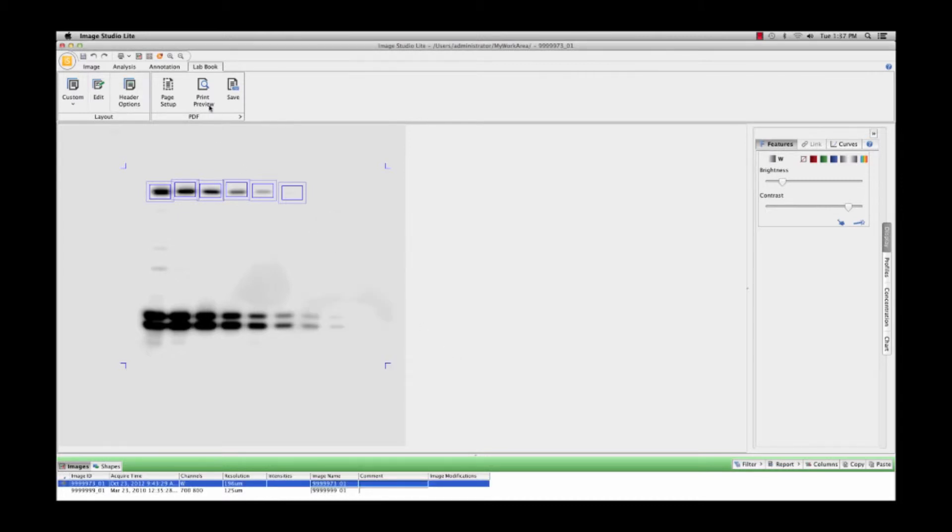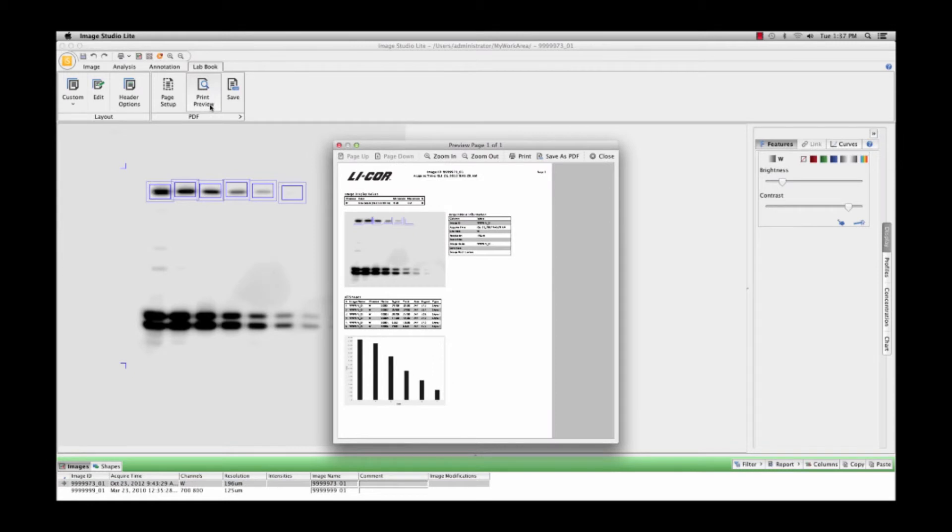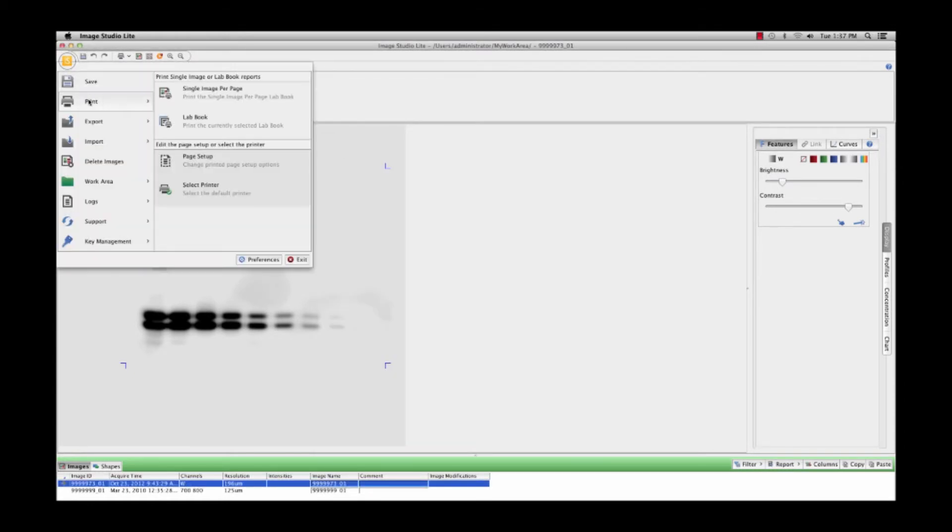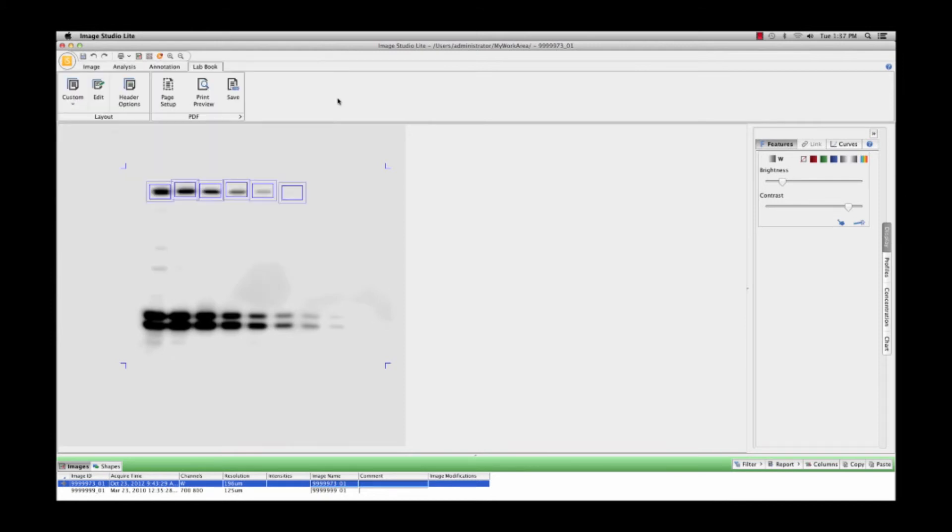A preview of the LabBook can be seen by selecting the Print Preview button. From here, you can print the LabBook file or save it as a PDF.